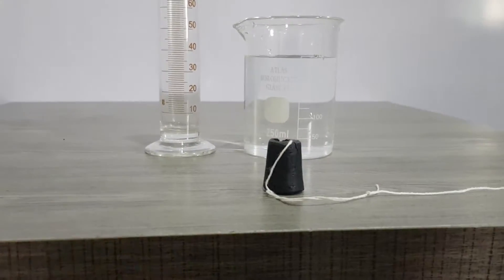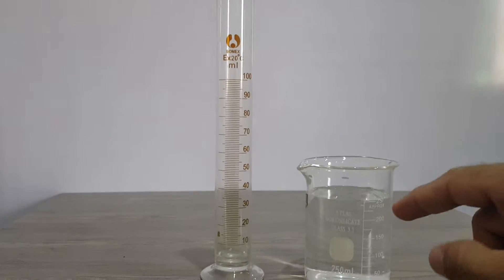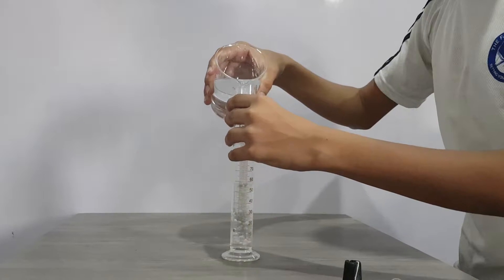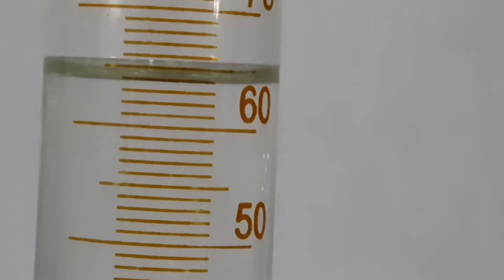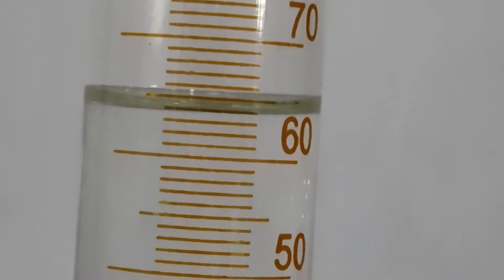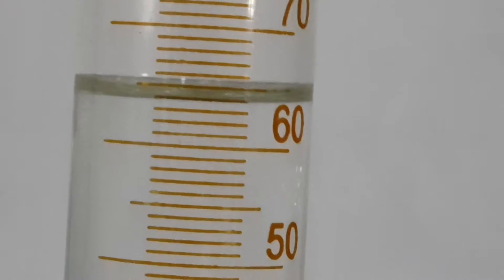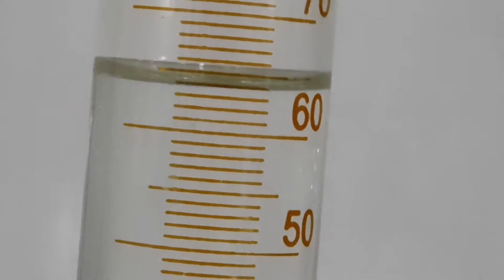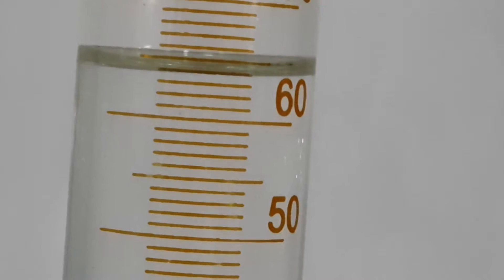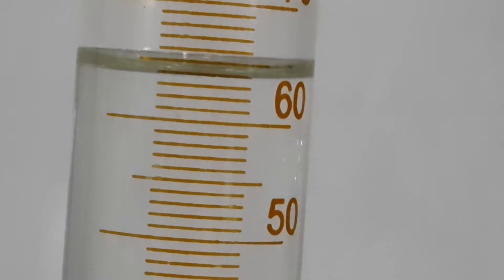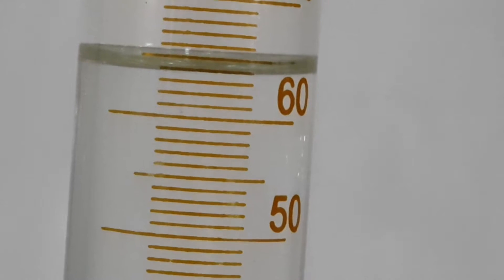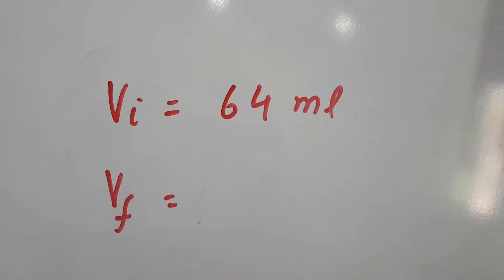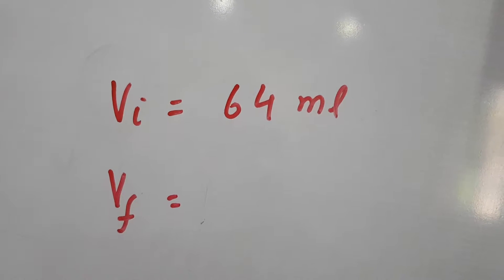Now add some water into the cylinder — stop. We will note the reading of the liquid, meaning water, in the cylinder. This is 64 ml. You will note the lower portion reading, because there is a meniscus — a curve — with an upper side and a lower side. Always read from the lower side. Note the initial volume: V initial is 64 ml.